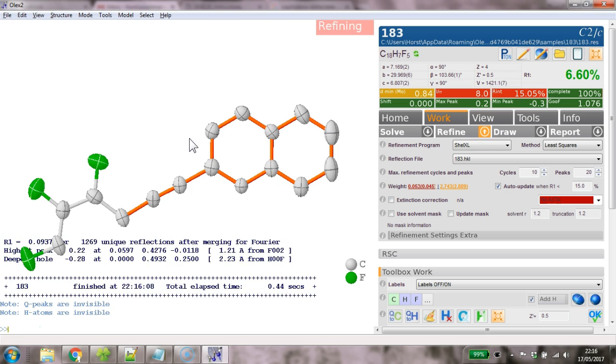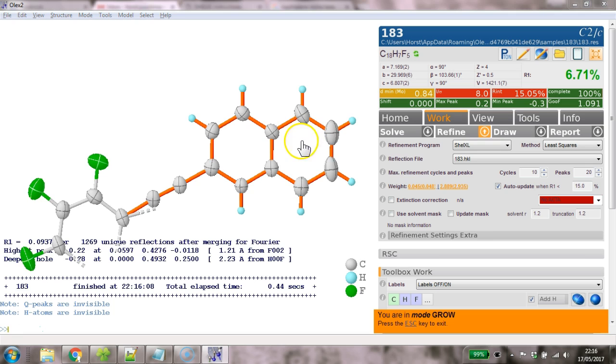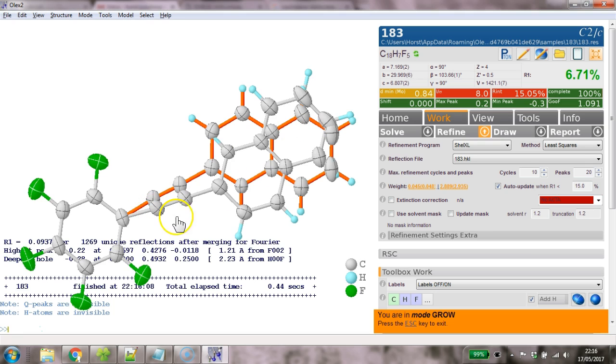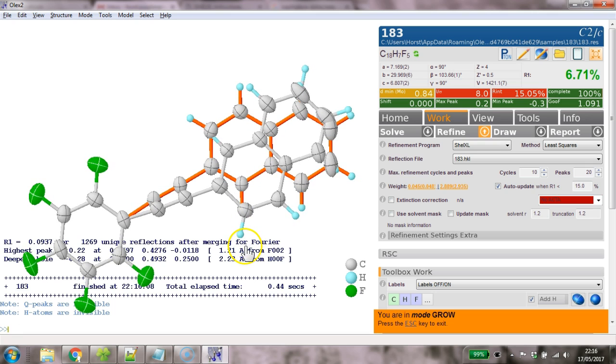Refine this. Yep. That looks pretty good. Control H. And if we grow this now, we can see the whole molecule. And this is how this has been modeled here.